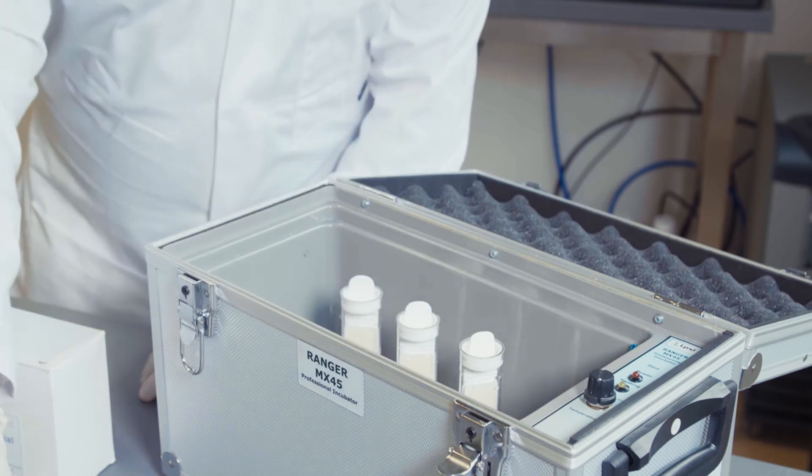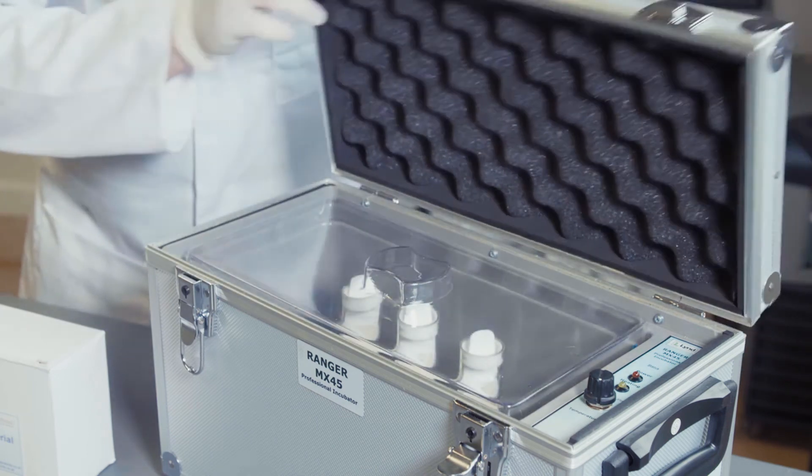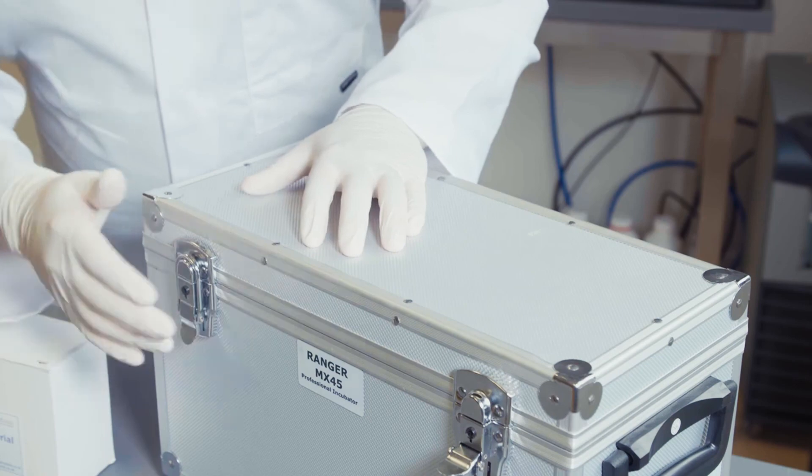Place the dip slides standing vertically into the incubator and close the lid. Incubate for 24 to 48 hours or per the manufacturer's instructions.